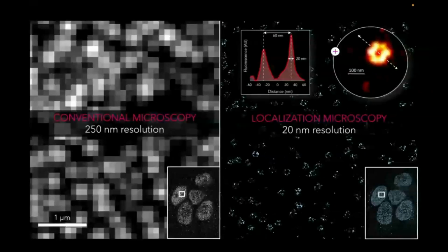However, it would be wrong to suggest that it's as simple as conventional microscopy. There are things you have to do that you don't have to do for conventional microscopy, which make it more difficult. So I guess the question here that we need to answer is why? Why would anybody do that? And specifically, why would anyone do that in the context of immunology?